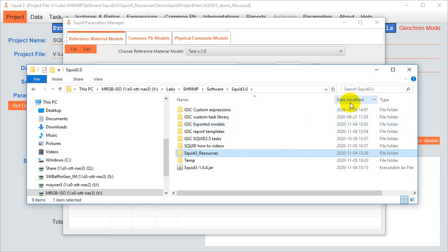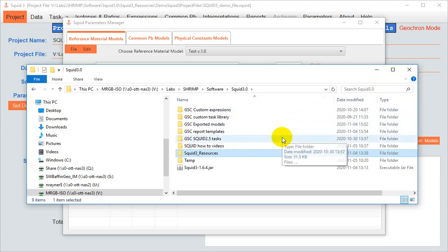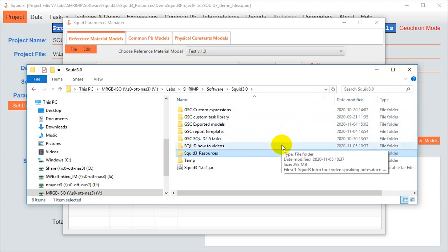Depending how your lab works, there might be one person or computer workstation that manages the shrimp data reduction for the whole laboratory. So that individual users can reduce their own data, but they're using tools like tasks and models that have been vetted by a super user. That's how we work here at the GSC.